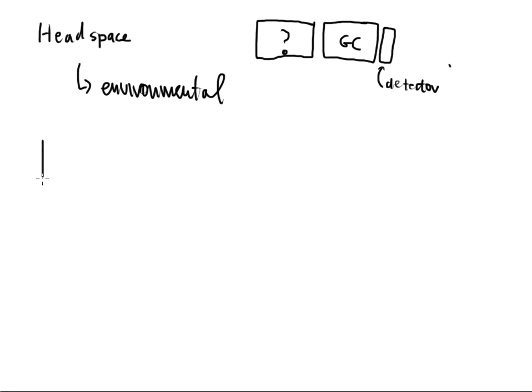Let's say that we've got a vial or a container, and I've got a lid on it. Could be a screw top lid, maybe with one of those pieces of rubber septa in the middle so it can get punctured. But in this container, I have a liquid solution. If this liquid solution was just simply an organic molecule, then I'm A-okay.